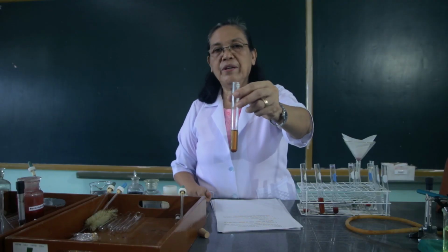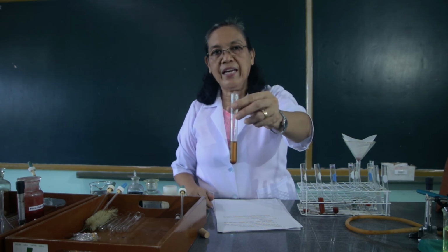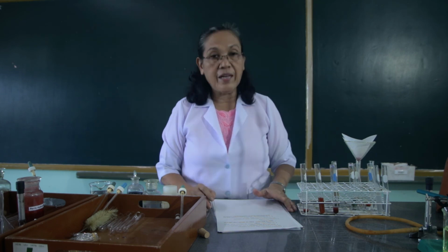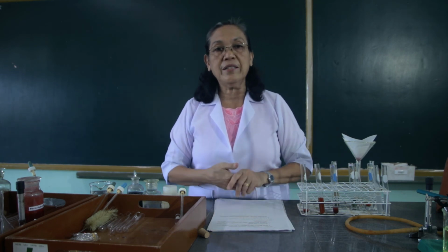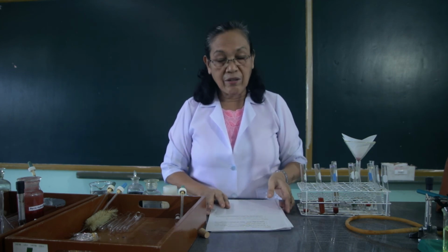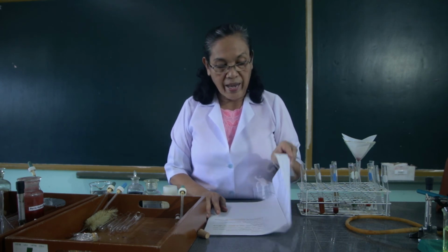So I want you to define what is a gelatin solution, and I want you to define what is a gel. So those are all for the activity today on colloids. What I would like you to do is to write all the observations you have made and also answer the questions given in the lab guide.